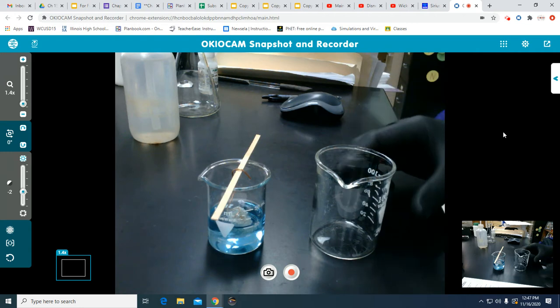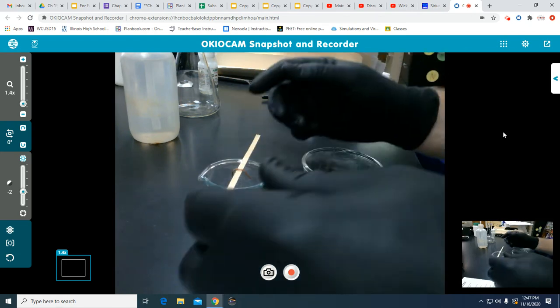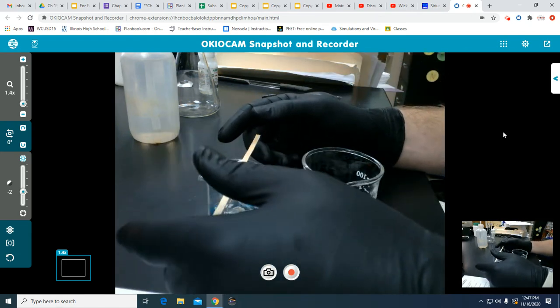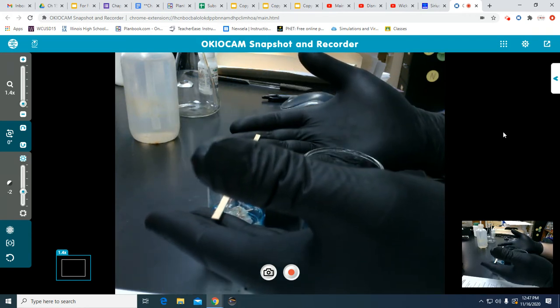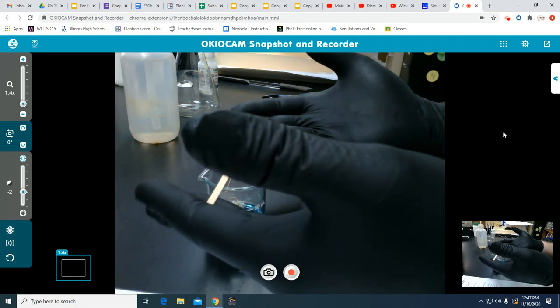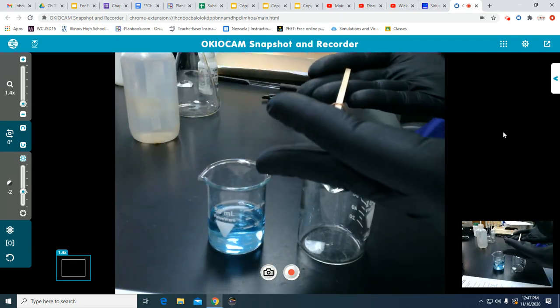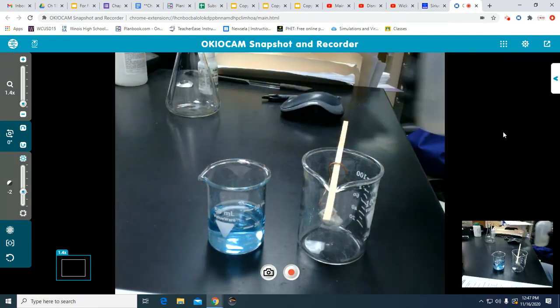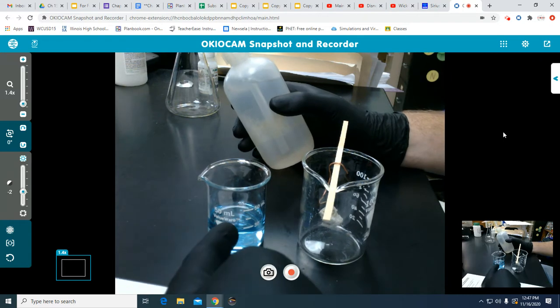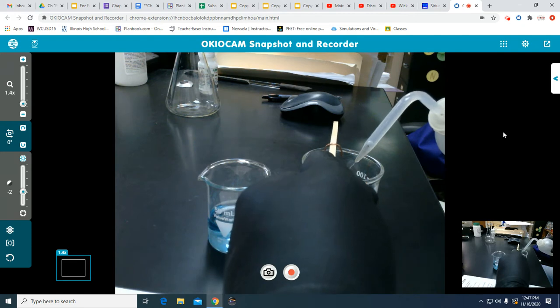Okay, so I want to be really careful with this because it is very fragile. It's not on there like it's with glue. It's just hanging on barely. So hopefully I can get my shaky hands to gently lift this up so I can save as much of the product as possible. And there we go. Perfect. So now I'm going to use the same water I used to fill this beaker up to rinse off the silver. It should come off pretty easily.